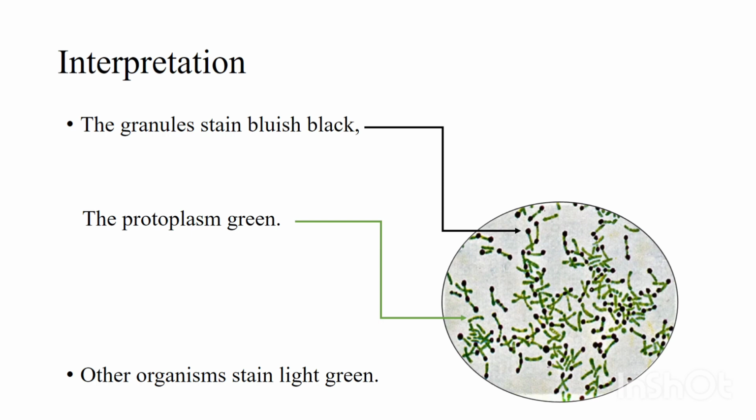So this helps us to easily differentiate Corynebacterium diphtheriae from other diphtheroids, the other Corynebacterium species. Hope this post helps you to make your Albert staining procedure easy and helps you to differentiate Corynebacterium diphtheriae.